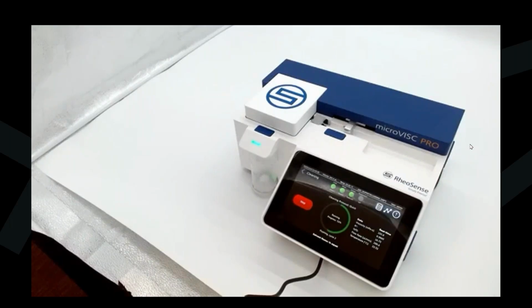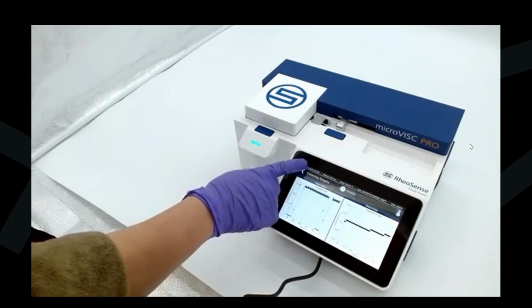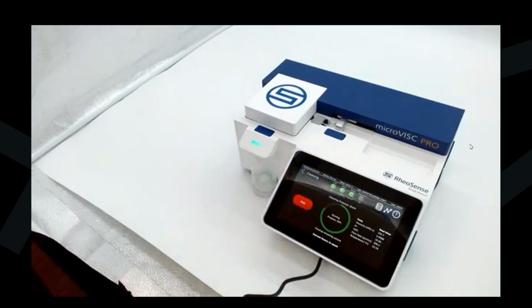So as you're measuring all the samples and you're pushing, or as you're cleaning, as you're doing now, all of that sample is being directed into the waste container. It's also showing you real-time data of viscosity and other parameters that you may be interested in looking at while you're cleaning. And you even have access to the real-time graphs that we saw earlier for the measurements. However, this data here is not stored as it was when you were measuring the sample. It's only for real-time viewing.